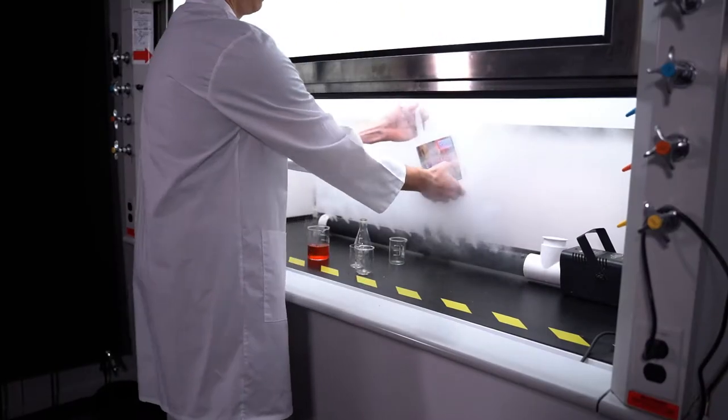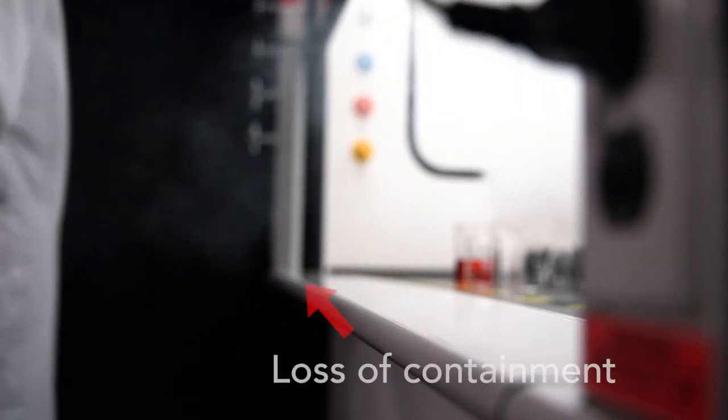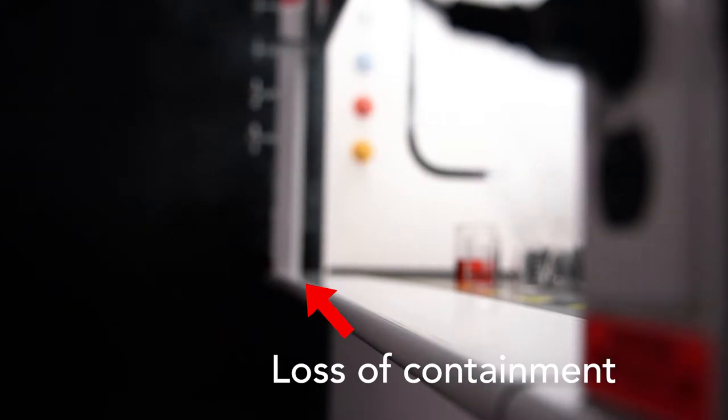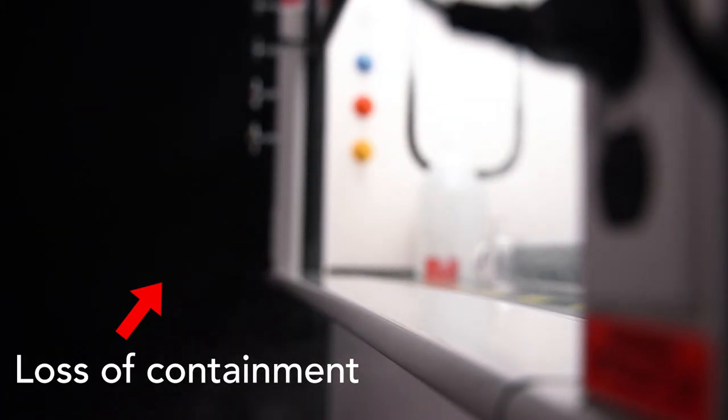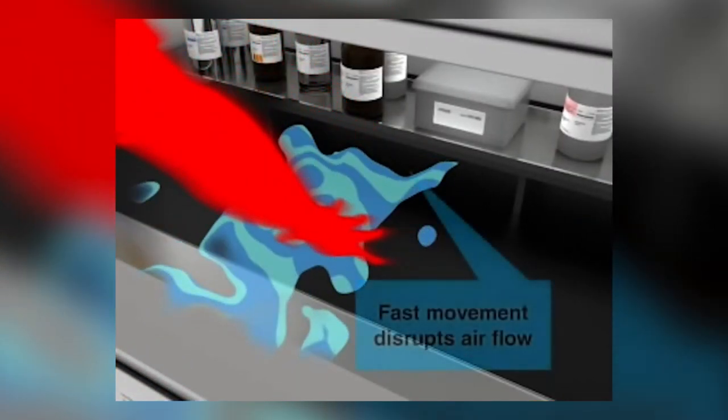Do not reach into the fume chamber and pull your arm out fast. Fast movement can pull air out of the fume chamber, as can user traffic in front of the hood. Always move slowly in and around the hood, and be cognizant of other air movements such as ceiling diffusers, fans, and open doors.